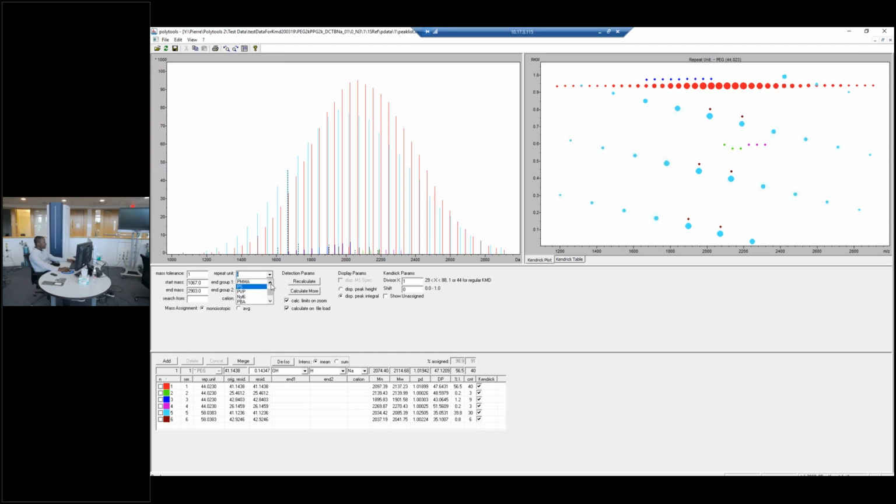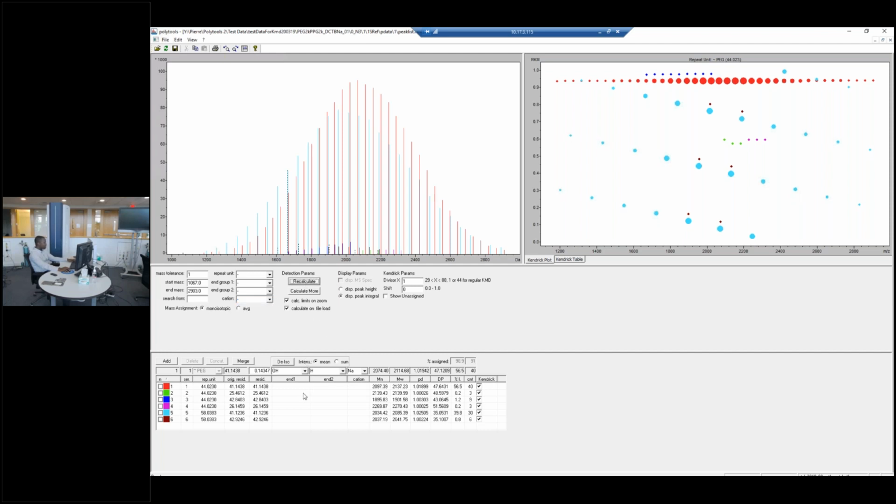So all of these are things that you can analyze, PMMA, easily with MALDI and be able to determine them or figure if they correspond to what you're looking for in PolyTools. You could also go in and match it with different kinds of ions, so sodium, potassium, different end groups, and calculate to figure out what's going on.